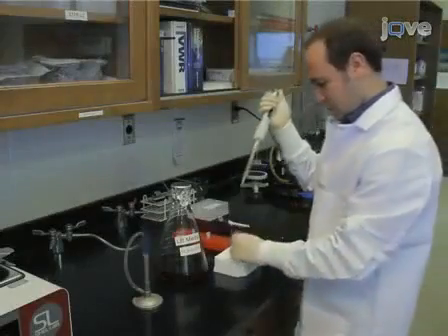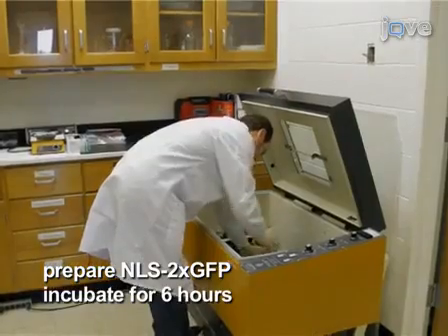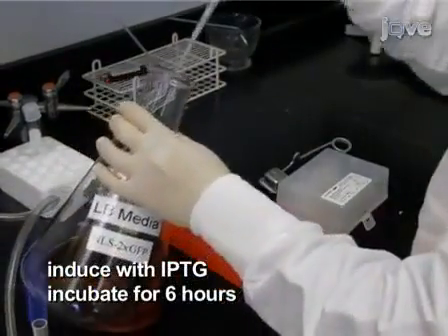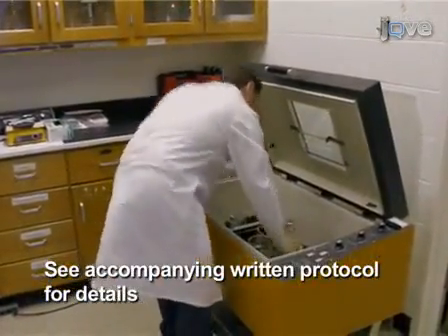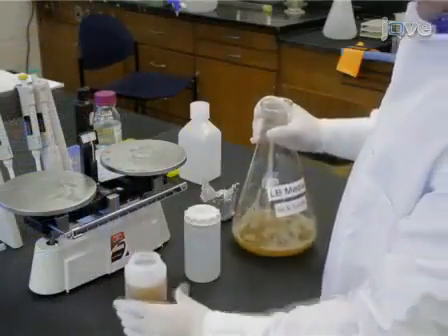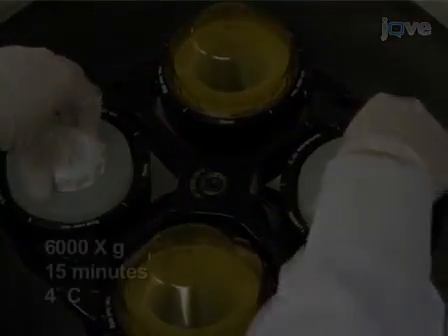To prepare the proteins for the nuclear transport experiment, conventionally transformed JM109 E. coli, expressing the genes responsible for production of the nuclear cargo proteins, are grown in LB media and induced with IPTG. Once the cells are in log phase with an optical density of 0.7 to 0.8, spin the culture at 6,000 times gravity.